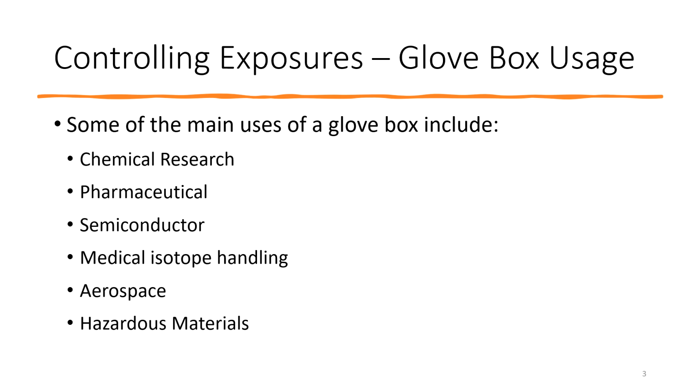Hazardous materials, some things will catch on fire when exposed to air, so we want to go ahead and do everything we can to use it in an inert atmosphere. And it's also good if you want to have things that will not soak up the humidity, change the chemical composition, all that good stuff of the hazardous material.